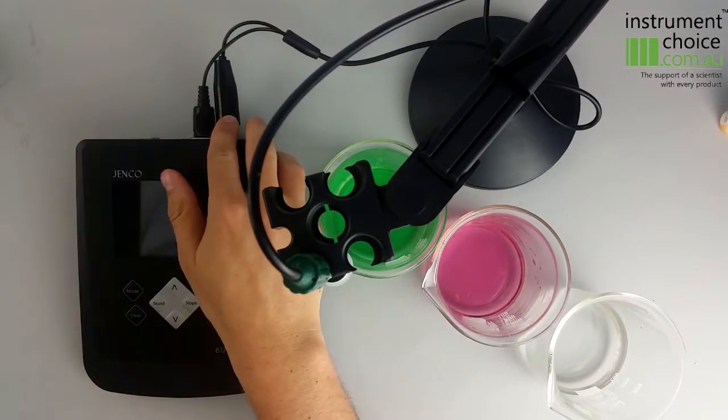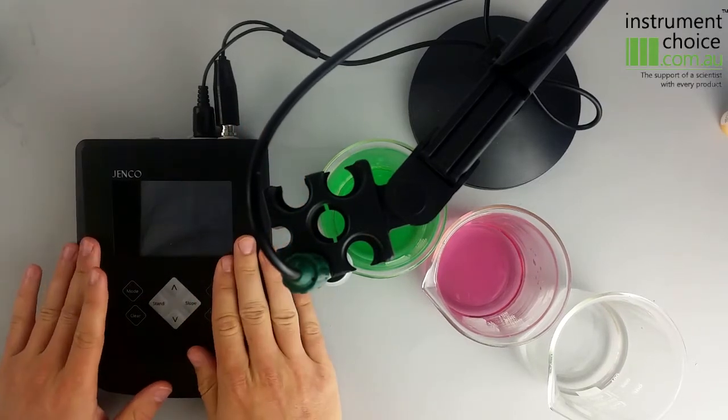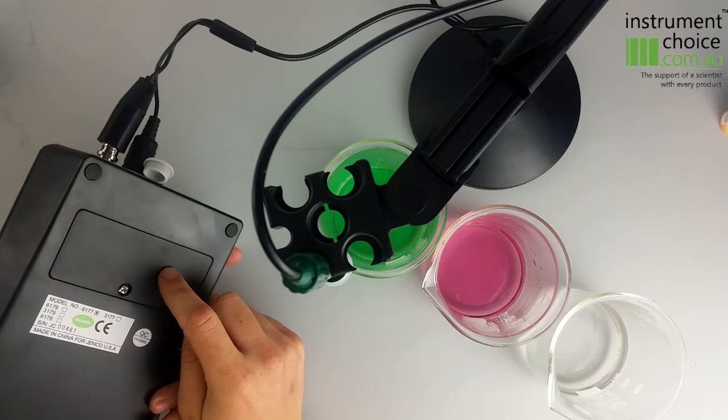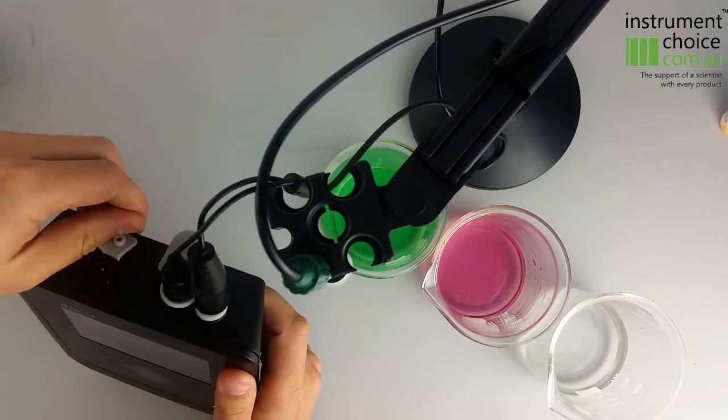It also has a standard BNC connection, so if you want to connect a third-party electrode you can certainly do that. You also get the unit itself. The unit can be powered by 6AA batteries that go into the back of the unit, or an AC-DC power supply that plugs into that little port there.